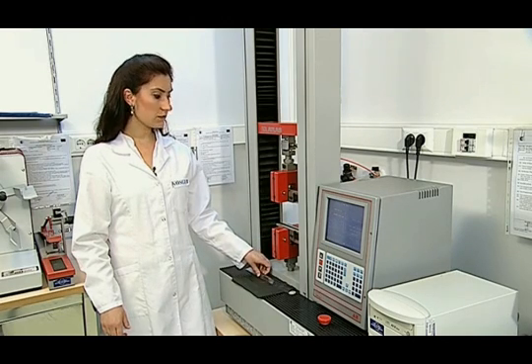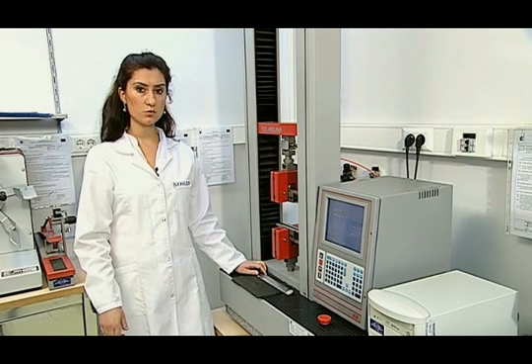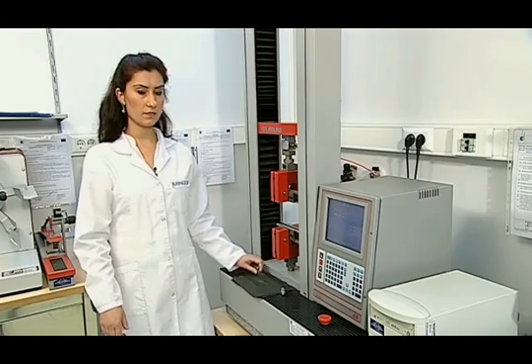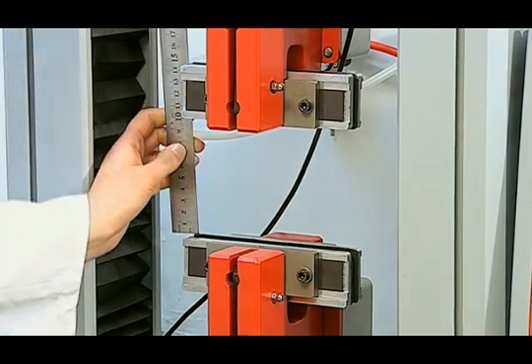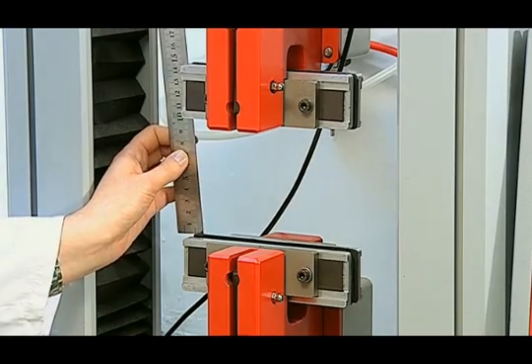Then, the distance between the two jaws, namely the length of the indicator, is set to 100 mm. It is checked whether or not the distance between the two jaws is 100 mm with a ruler.